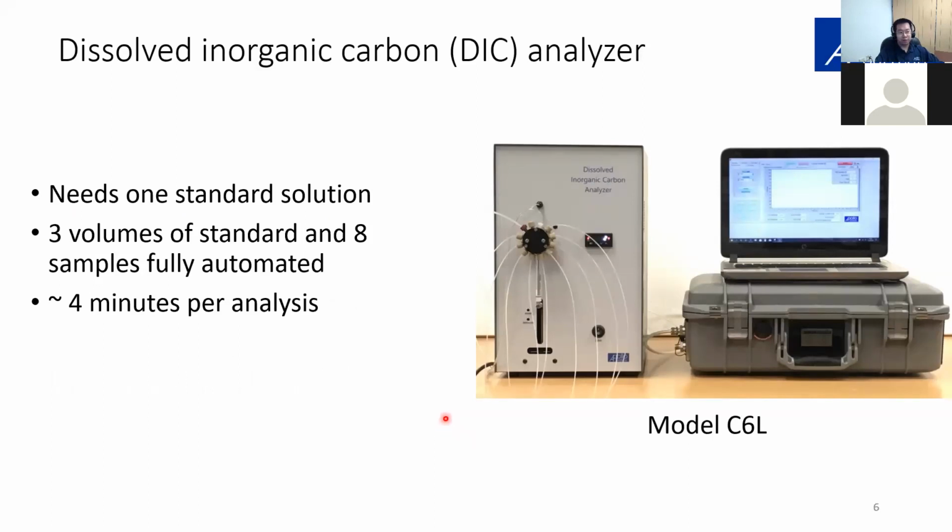One advantage of this whole setup is that it only needs one standard solution. And the 3 different volumes of the same standard and 8 samples are fully automated. And each repeat takes about 3 to 4 minutes.